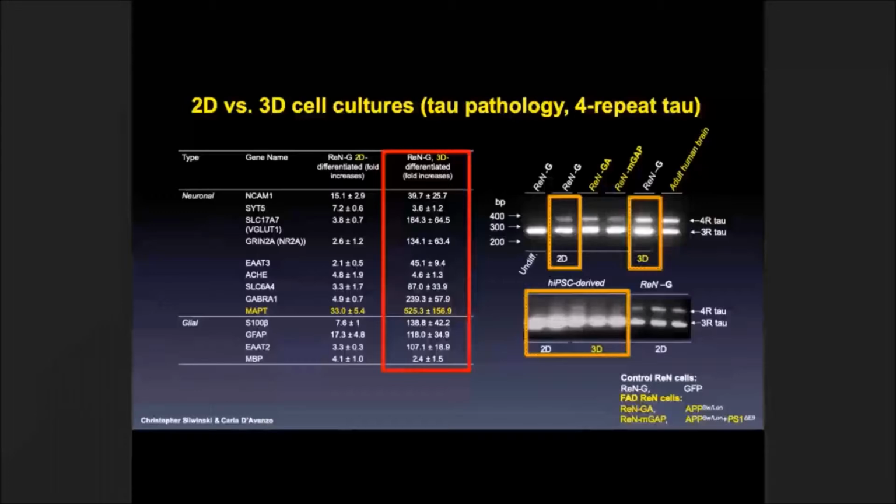We think that's why we have success in recapturing the tau tangle pathology in this model. We think this has something to do with the stage of the neural stem cells we are using, because the cells we used were from a 6-month-old human fetus. This is generally a late stage, and there is more capacity to go into mature neurons. We're still looking for iPS-derived neurons that make these things possible, but we're really having problems finding this type of pattern at this point.